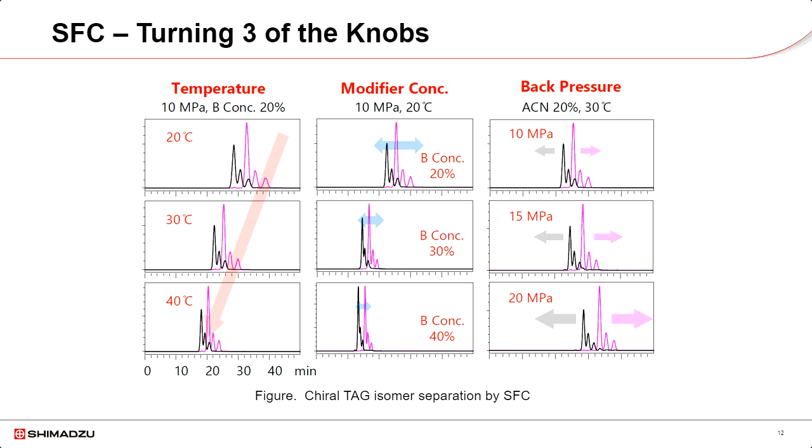But on this last column, back pressure, if we hold everything else constant, look at the amount of change in resolution that we can affect just by changing the back pressure. This is something that's very unique to SFC.